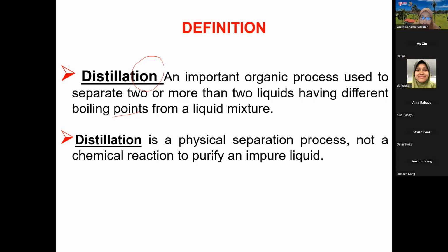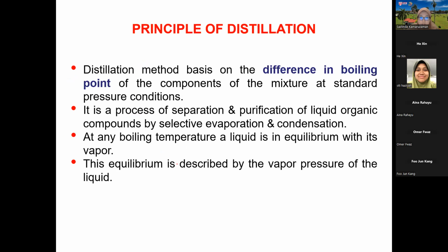Okay, so other than that, when we talk about distillation, we have so many types of distillation. Maybe some of them focus on separation, but some are based on purification. We want to purify it. Or maybe we want to separate it from the bulky solvent, for example, the one that we usually use in the lab, such as rotary evaporation, right? One of the setups for distillation. So this is quite similar. Of course, it is supposed to have a difference in terms of the boiling point. So the process will undergo separation and purification.